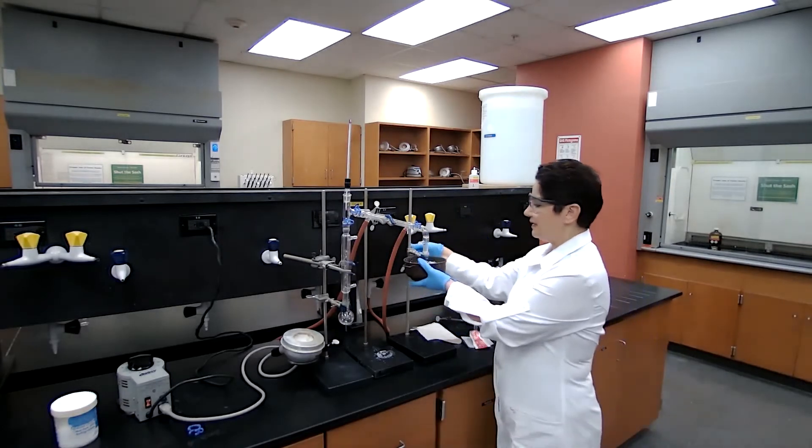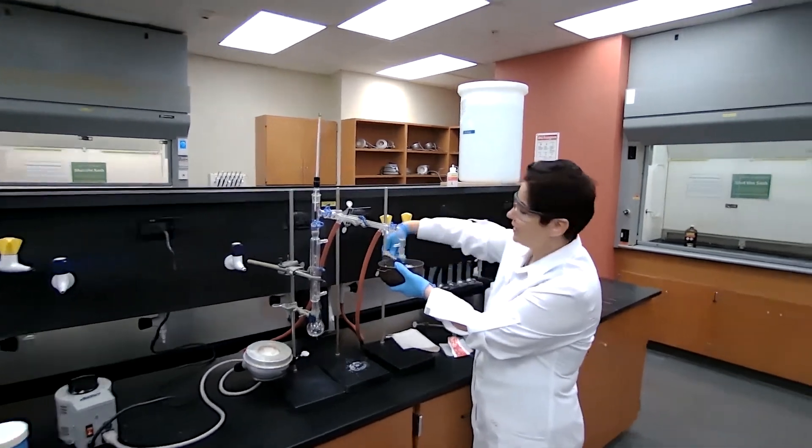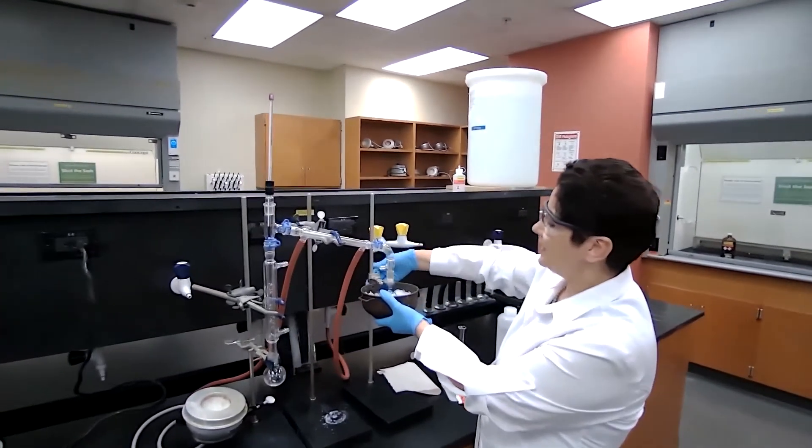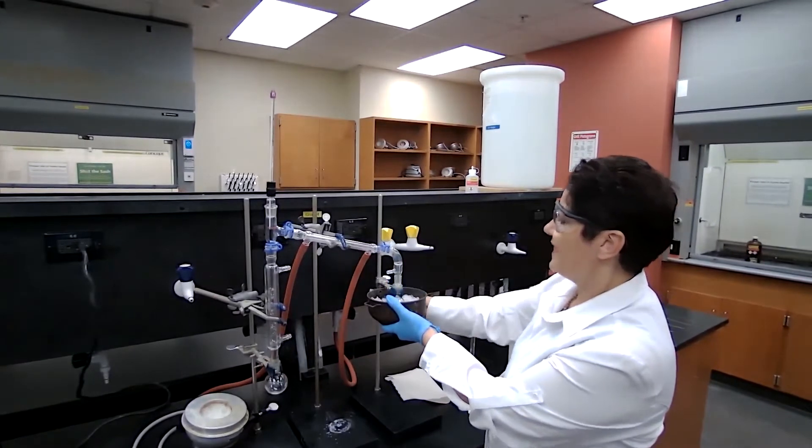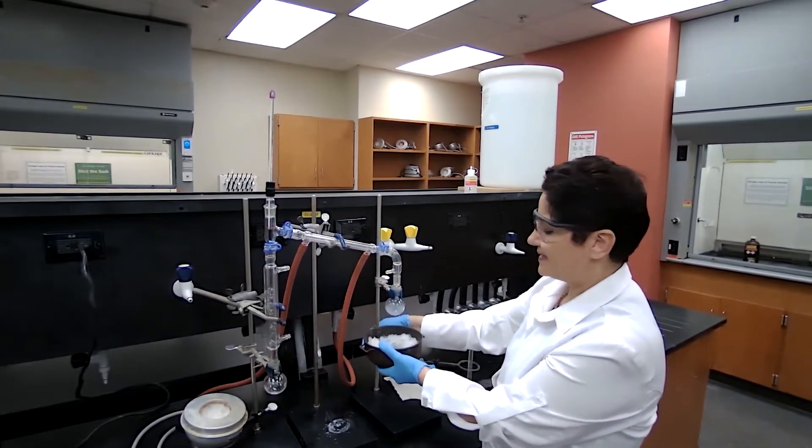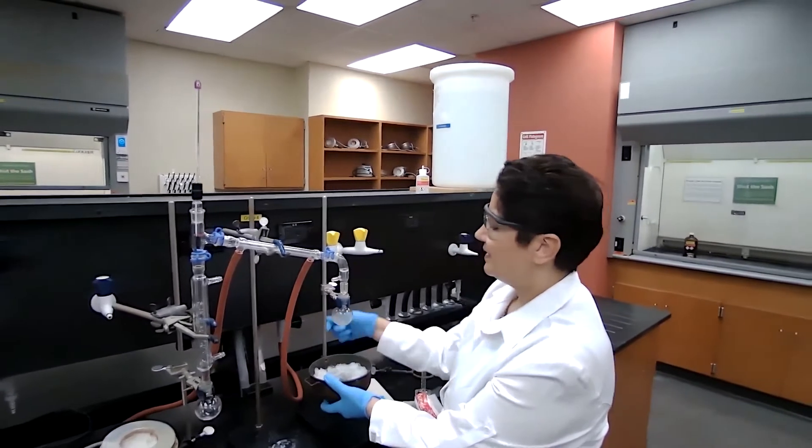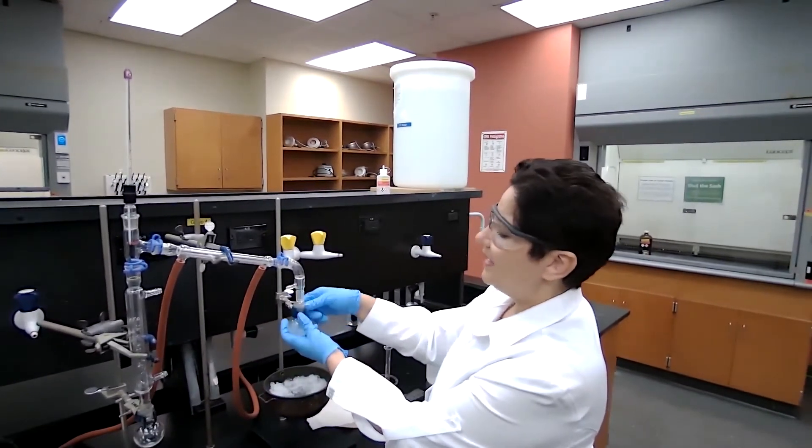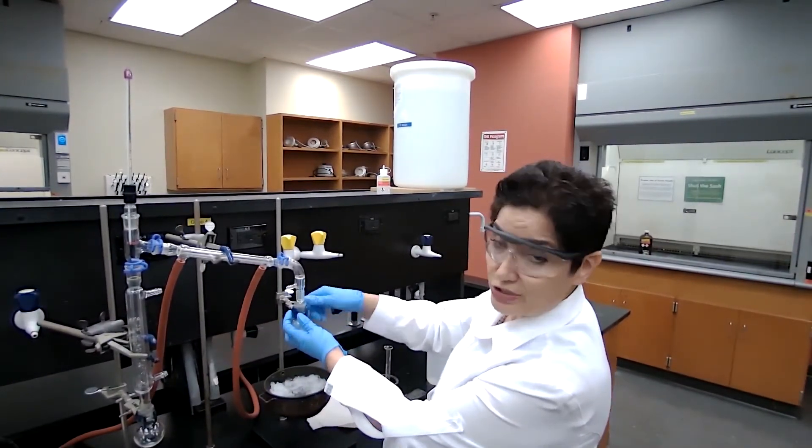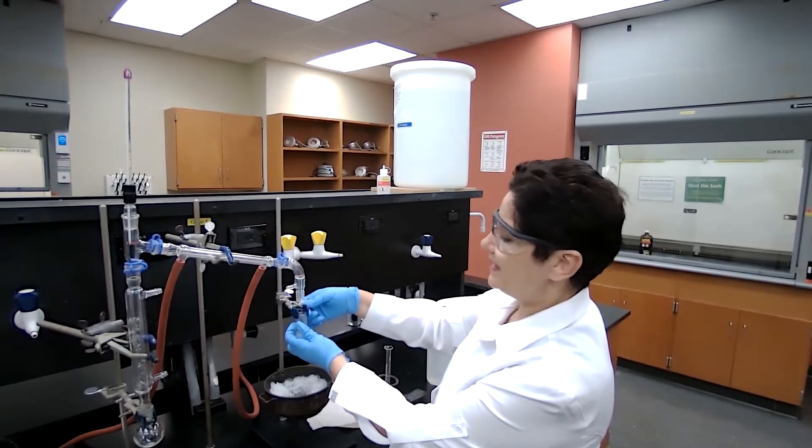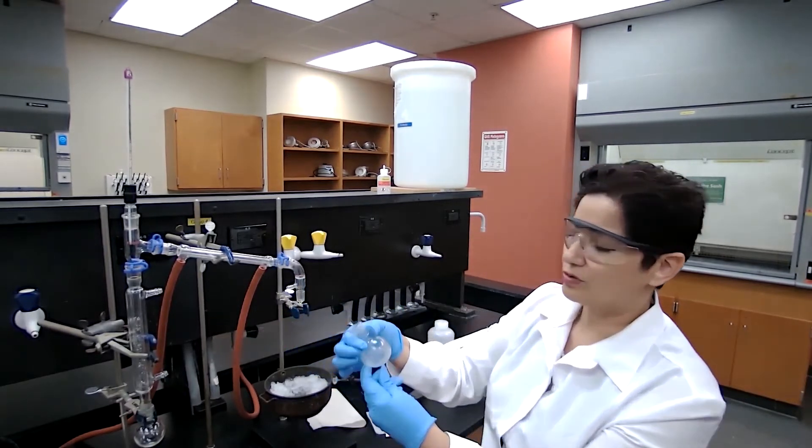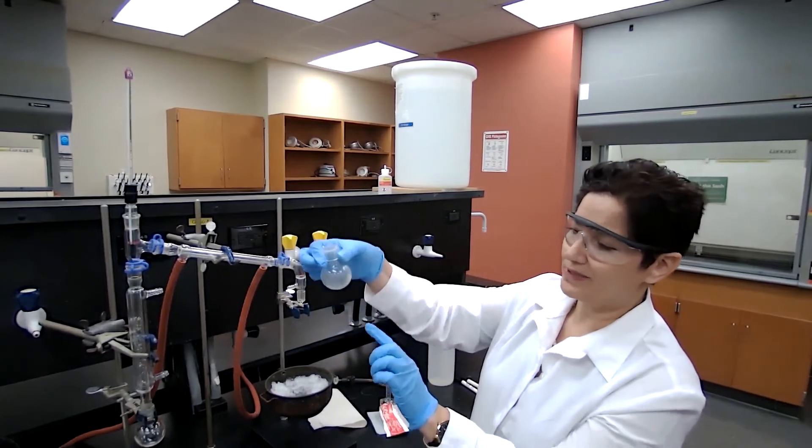The only difference here compared to experiment two is that we are using ice baths around our receiving flask. The receiving flask is a boiling flask, and the instruction says to collect about between nine and ten milliliters.